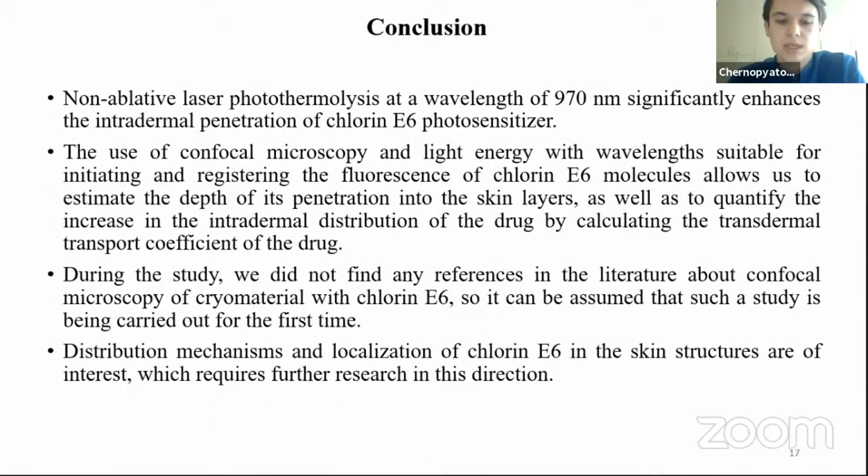In conclusion, we can say non-ablative laser photothermolysis significantly enhances the intradermal penetration of the chlorin E6 photosensitizer. The use of confocal microscopy allows us to estimate the depth of chlorin E6 penetration into the skin layers, as well as to quantify the increase in the intradermal distribution of the drug by calculating the transdermal transport coefficient of the drug.